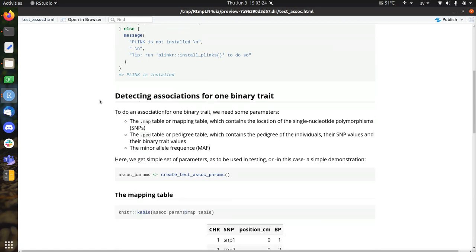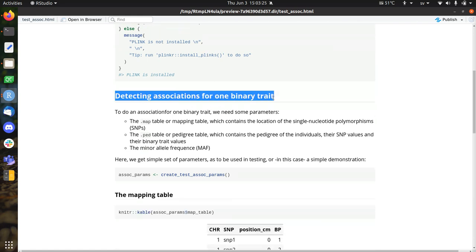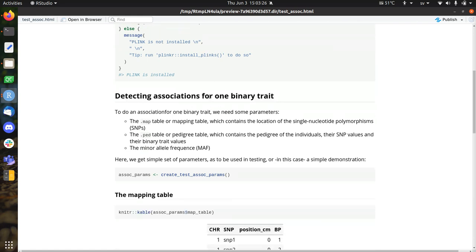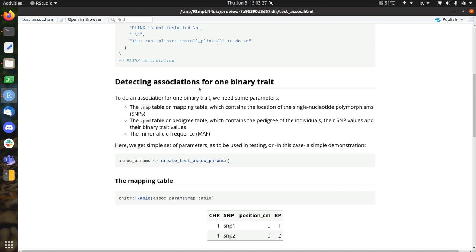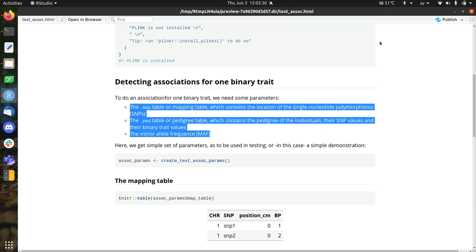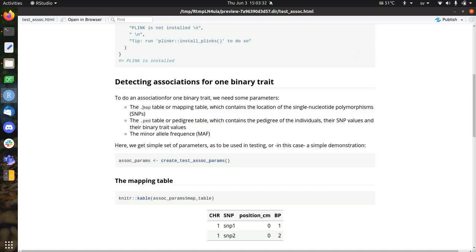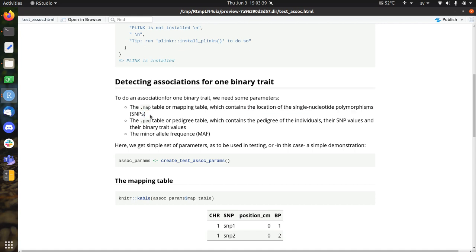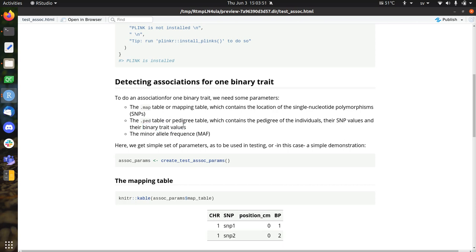We're going to detect an association with one binary trait. And there are two tables you will need. One is called the map. It's a file, it's a mapping table, which contains a location of single nucleotide polymorphism, the SNPs, and I'll show it below. And we also need a pedigree table, the .ped table, which contains both the pedigrees, but also the SNP values and also their binary trait values.